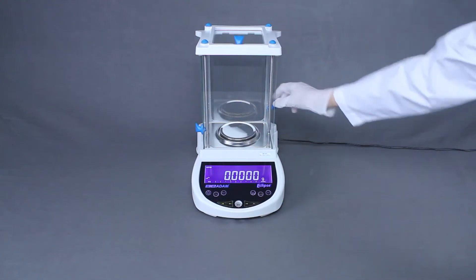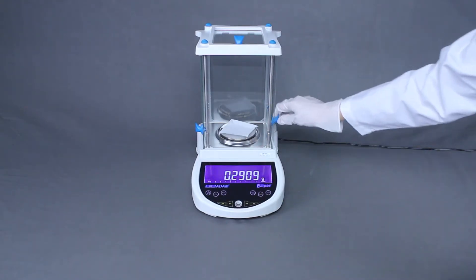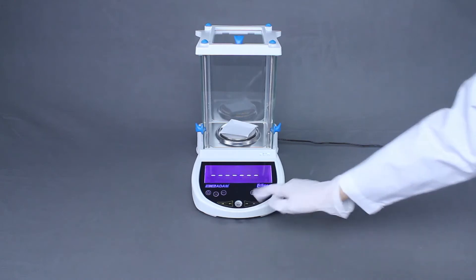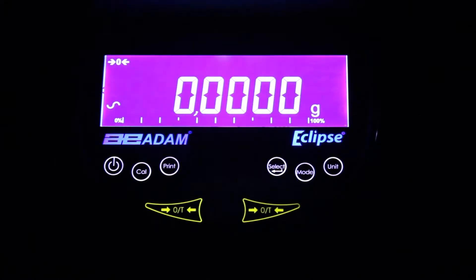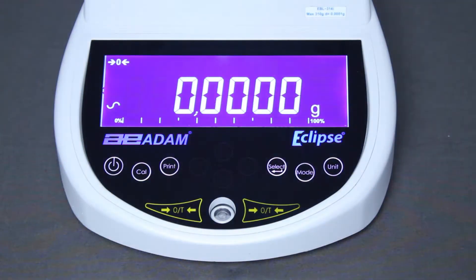The keys operate easily with just a feather-light touch and respond readily even to latex-gloved fingers. Featuring one of the largest LCD readouts in the industry, the Eclipse displays sizeable white digits on a deep blue background.